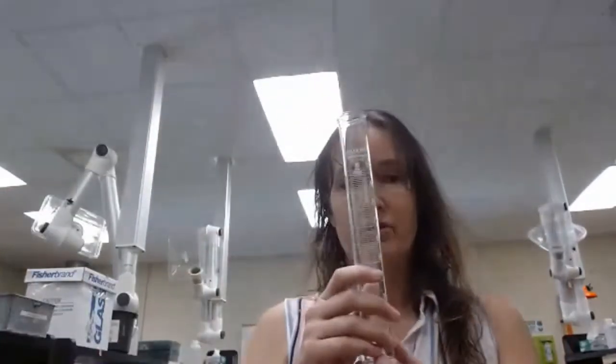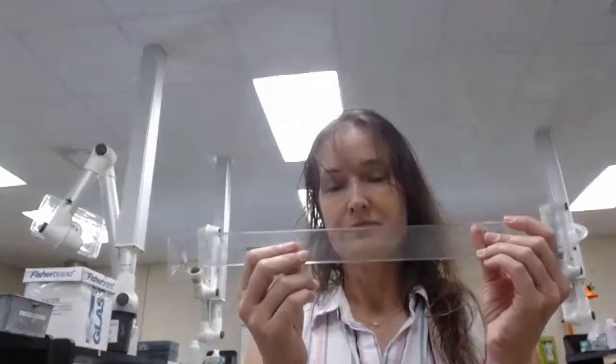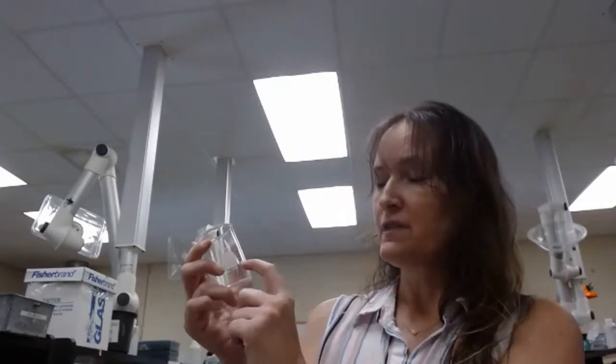When you are dealing with things with lines, such as the graduated cylinder, the beakers, and a ruler, each of these measuring devices has lines. Now we can use these devices just to hold material, but if we want to use it to actually measure the material we put inside of it, then we look at the lines. Every line, whether it has a number next to it or not, is a known quantity. So those are known parts of the significant figures.